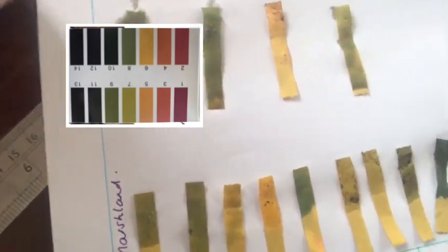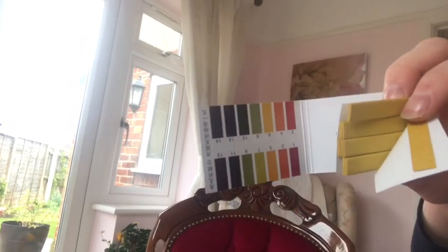So let me show you the data that we have got. There we go. And obviously we have our lovely little record to go with it. Don't worry, I'll put pictures of these with the video on eBrock for you to have a look at. And all I wanted to say was there's a lot that we can think about with these. Clearly there is some variation, so that's a success. We can see changes, but it's not vast. Those colours don't change massively.